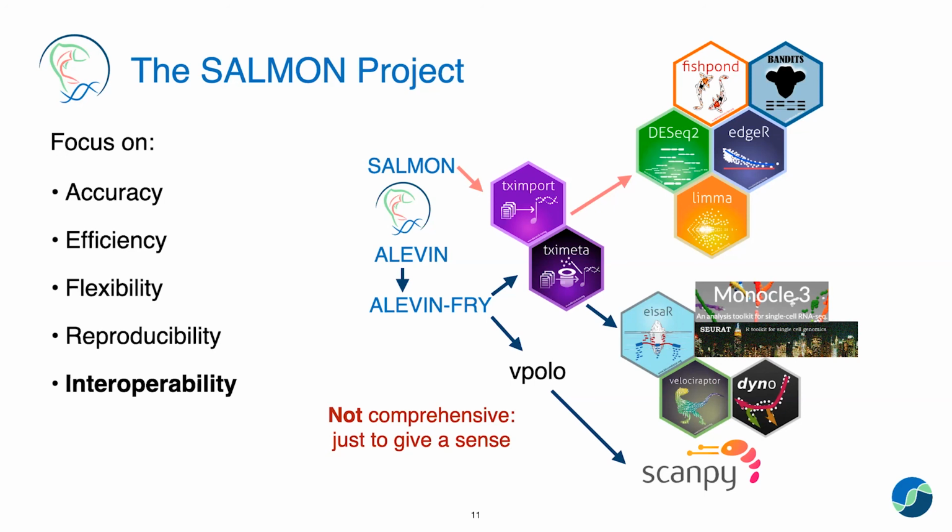We provide a couple of different output formats. Some are focused on compression and keeping the output files small, and others are focused on easy parsability, such as a standard sparse matrix format.